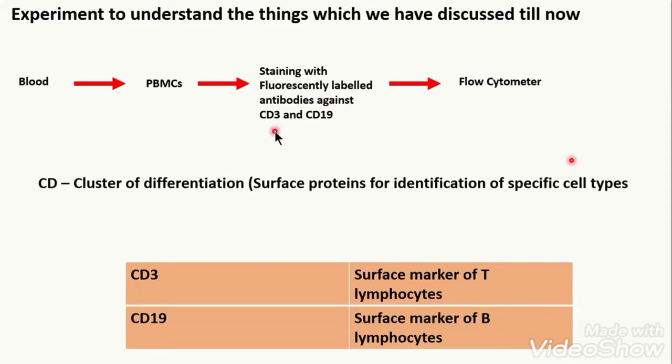So you want to check the immunomodulatory property and you want to count that after injecting that drug or before injecting that drug, what is the number of T cells and B cells, T lymphocytes and B lymphocytes in the body of rat, mouse, human, whatever organism you are taking. So you can do that by flow cytometry.